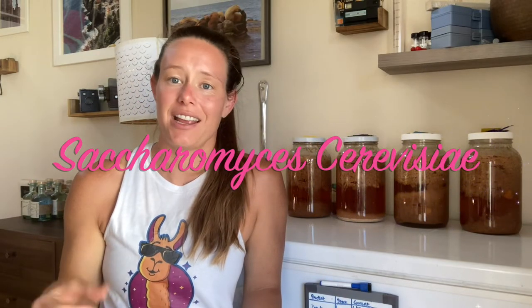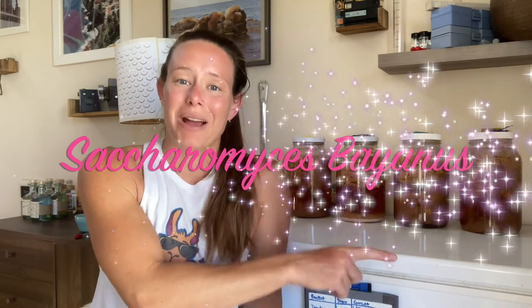In the farthest jar over here, I chose the Red Star Premier Cuvée. Next to that, I chose the Lalvin D47. Next to that, I chose the Lalvin K1V1116. And right here is kind of my, like, maybe control. I don't really want to call it a control, but this is a fermentation that I started using Red Star Distillers yeast. Now, both the Lalvin D47 and K1V1116 and the Red Star Distillers yeast are all Saccharomyces cerevisiae strains. The Red Star Premier Cuvée is actually Saccharomyces bayanus.